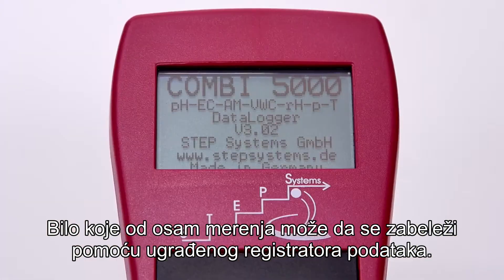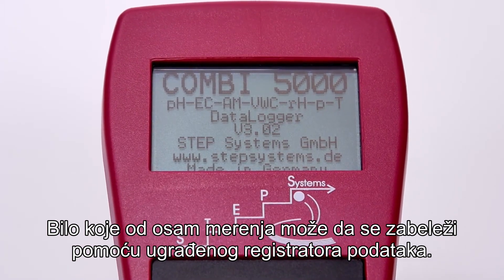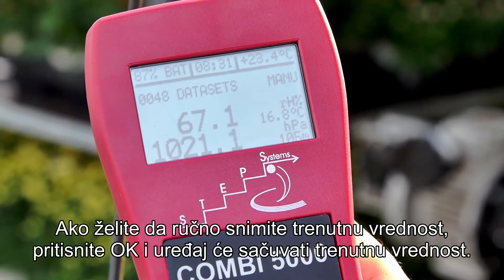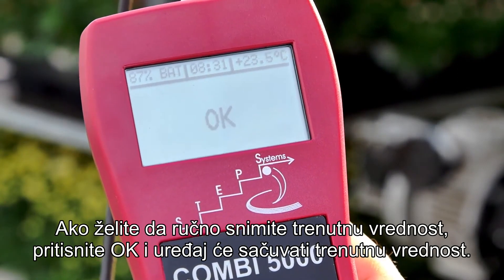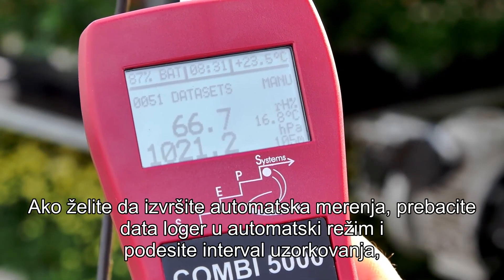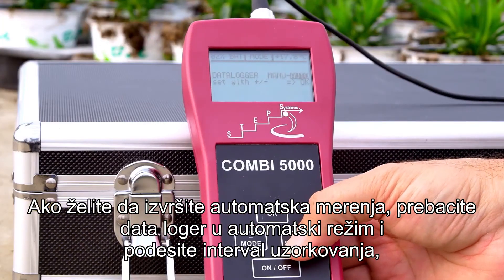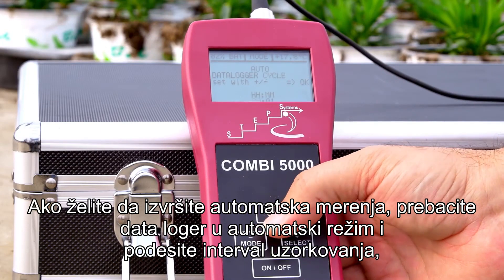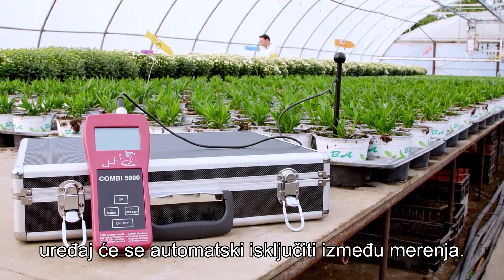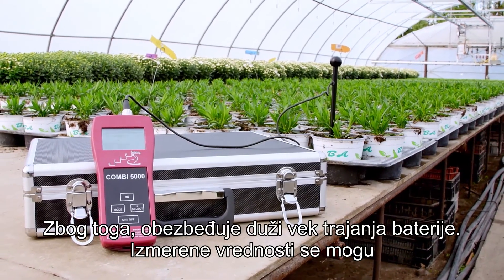Any of the eight measurements can be logged using the built-in data logger. If you would like to manually record the current value, press OK and the device will store it. If you would like to take automatic measurements, switch the data logger into auto mode and set the sampling interval. The device will automatically switch off between measurements, therefore providing longer battery life.